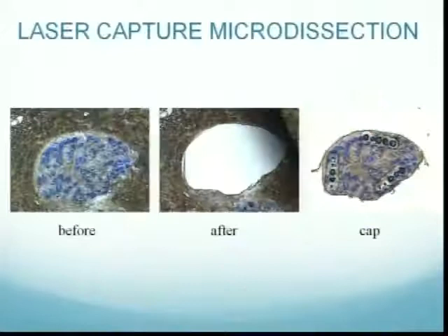Going back to the point I made about the importance of having a homogeneous sample, half of the class would know that the human breast is comprised mostly of fat, muscle, and stromal tissue. The origin of breast cancer is actually the milk ducts, which are these things here in blue. We wanted to understand the transcriptional differences between the breast cancers and normal epithelium, or the normal milk ducts, where the origin of breast cancer is. So we took these normal breast tissues, sectioned them in small slices, and put them under a special microscope called a laser capture microdissection scope. Once under the microscope, we take a laser and circumscribe these cells out of the tissue, and this is what we extract our RNA from, to get this pure population as a comparator.